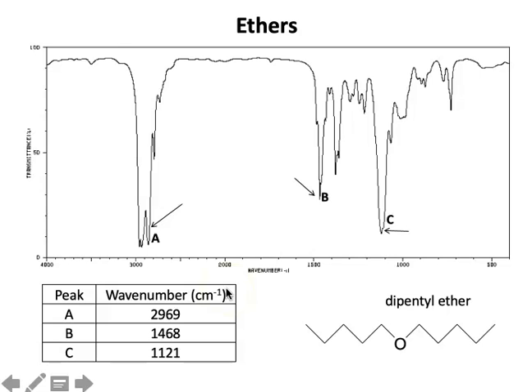If we really cared about assigning this as an ether, which I think there might be one question on in your handouts, this super intense peak right here in the fingerprint region, around 1100 or 1200, is usually due to some sort of CO bond stretch. Do we really care? No, because it's in the fingerprint region and your brain will hurt if you go there.